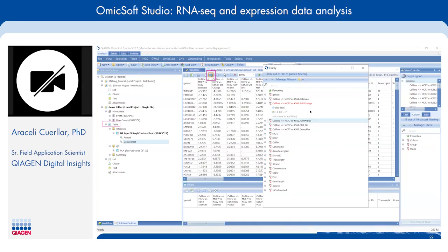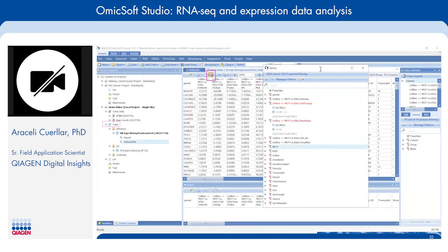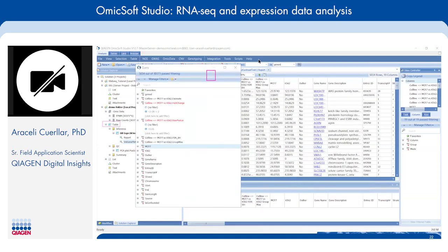You can also, for example, filter by p-value. So you can enter a value, let's say, of less than 0.05. So we can go ahead and enter that. And then again, click on enter to type that in. As you can see, as we are filtering, our number of rows are being filtered to only those that specify those requirements that we are interested in.